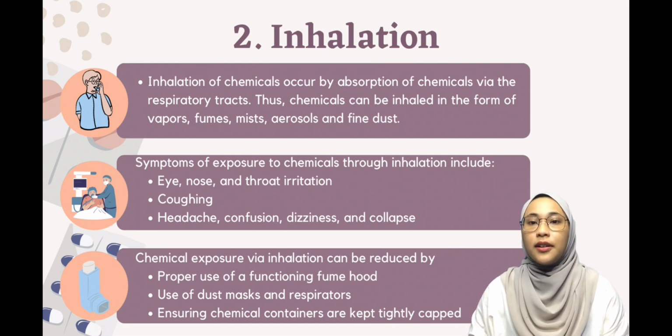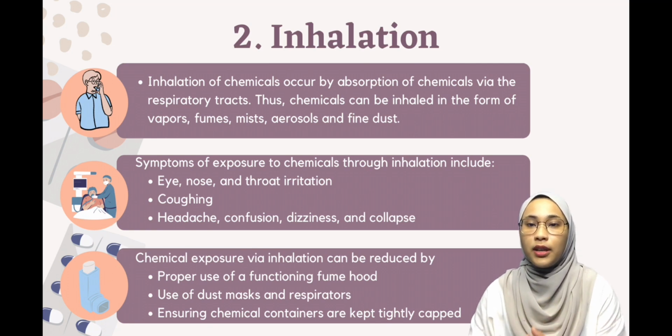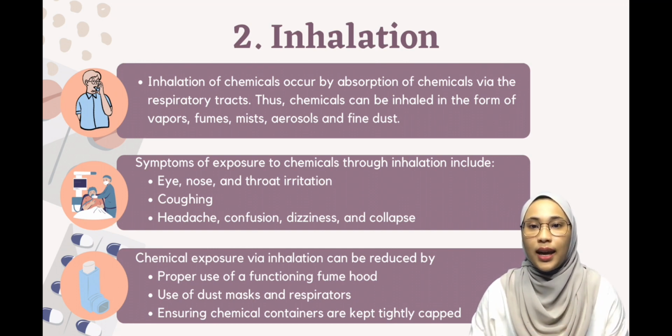Chemical exposure via inhalation can be minimized by the proper use of a functioning fume hood for chemicals that produce vapors. Next, use dust masks and respirators in the laboratory. Finally, make sure chemical containers are tightly closed and that any chemical spills are cleaned up quickly.